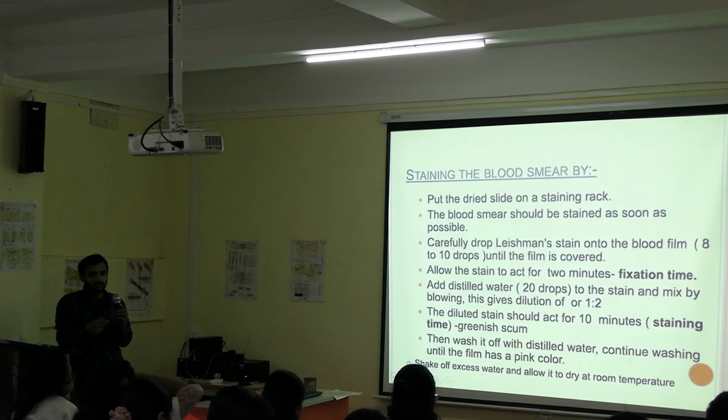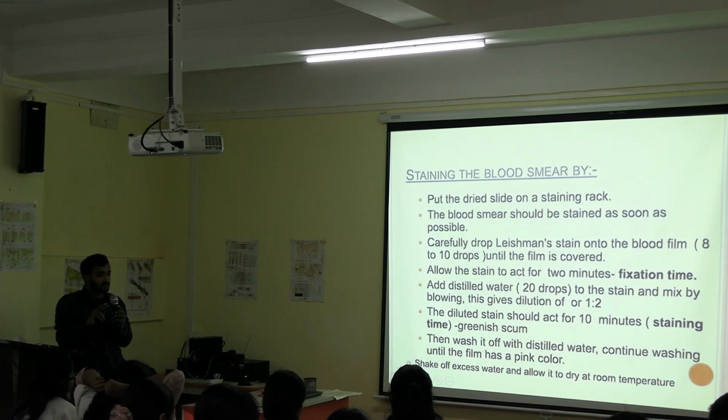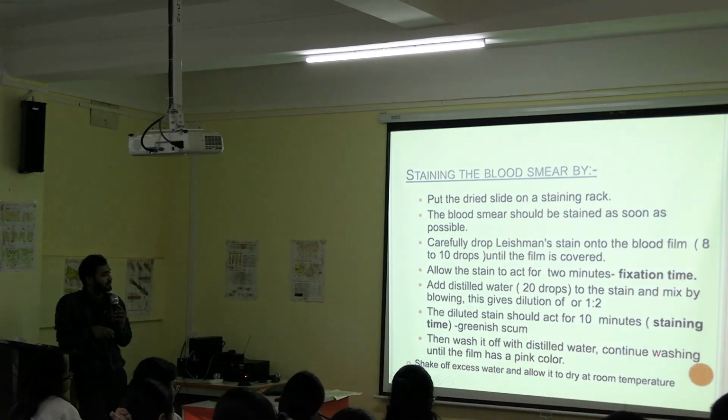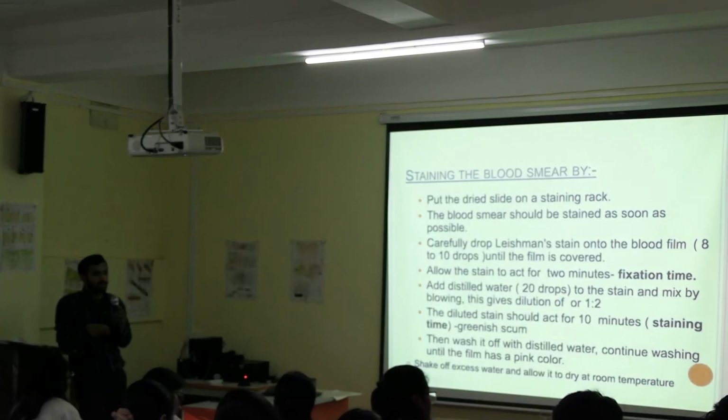So here there is eosin, and the other one is what? Two stains, right? Yes, methylene blue. So these two are acting now. We are giving water here, so now it will be staining. You might see a greenish tinge come here after applying the water.